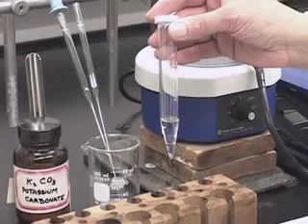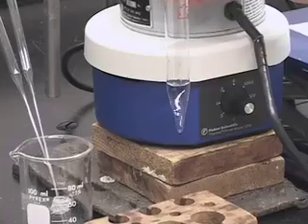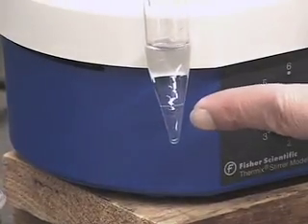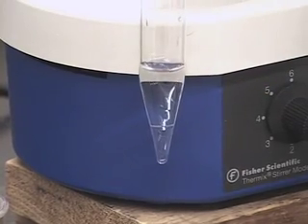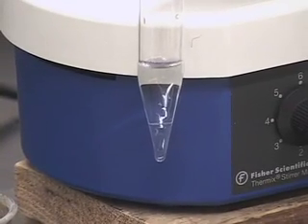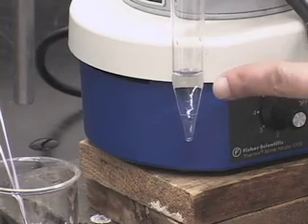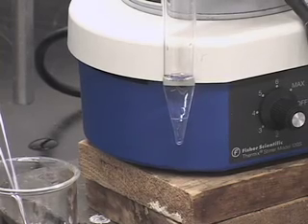We have our product mixture in this centrifuge tube. If you notice, there are two layers in this centrifuge tube here. The bottom one is the aqueous and the top is our organic layer. We did the dehydration of 2-methylcyclohexanol. One of the side products is water, and that is what you have here at the bottom of this centrifuge tube. The top layer of course has our product mixture as well as some of the xylene.